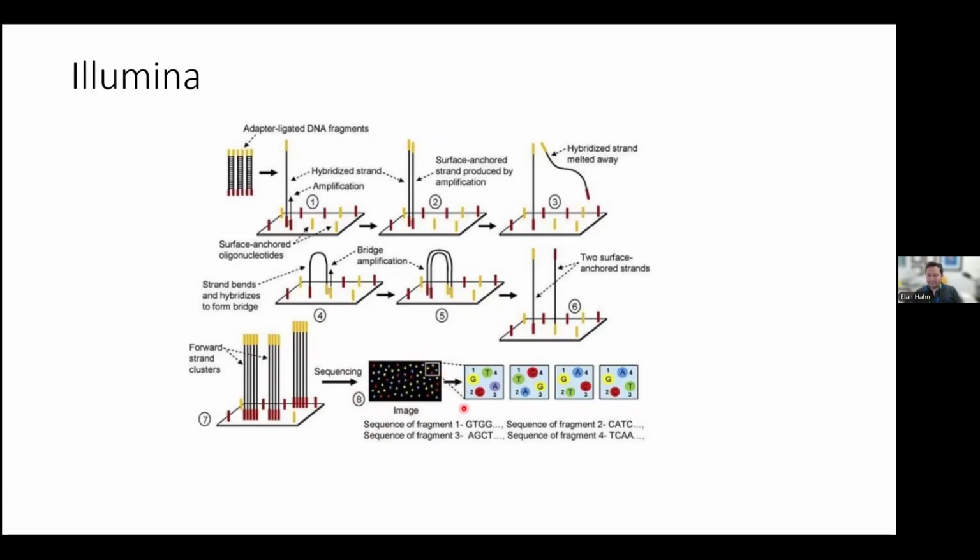And so we're able to see the elongating sequence by subsequent images that are taken. Then this whole process is repeated again for the reverse strands. And all of this data of colors at certain time points, at certain lengths of strand, is converted into base calls by the software and bioinformatic analysis.